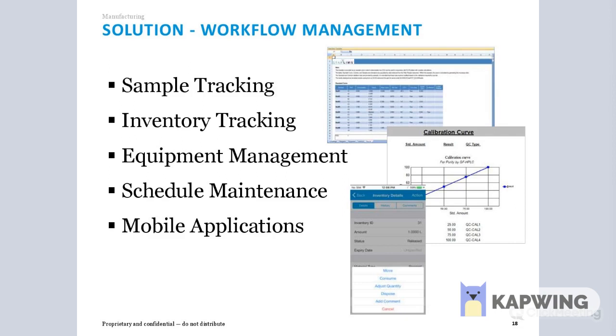You can organize the shipping and receiving of inventory items in the system as well. LIMS gives you the ability to monitor equipment usage and calibration or maintenance without the need for old school logbooks or calibration stickers. You can automatically schedule sampling points for your environmental monitoring and QC samples based on your schedule need, such as daily, weekly, etc.